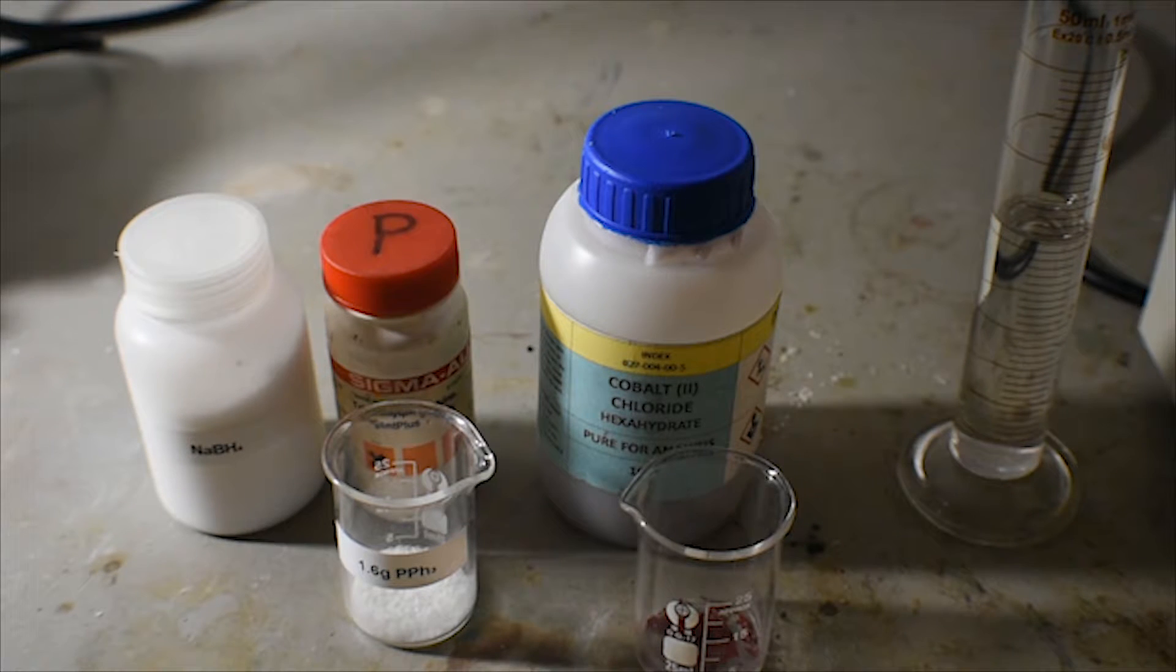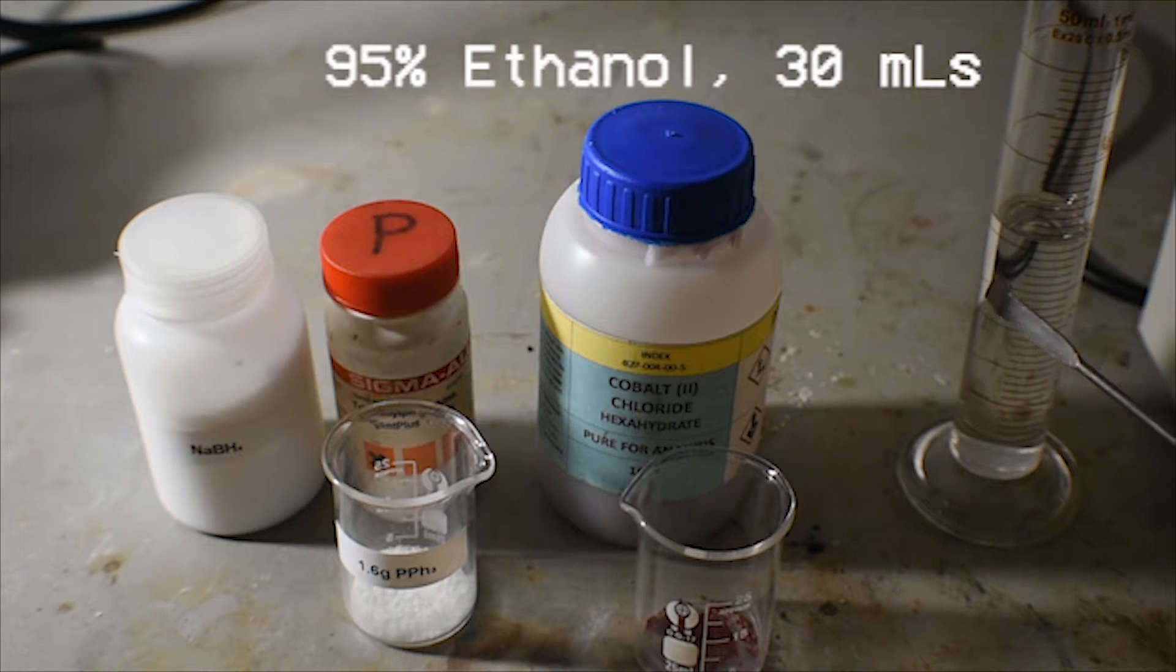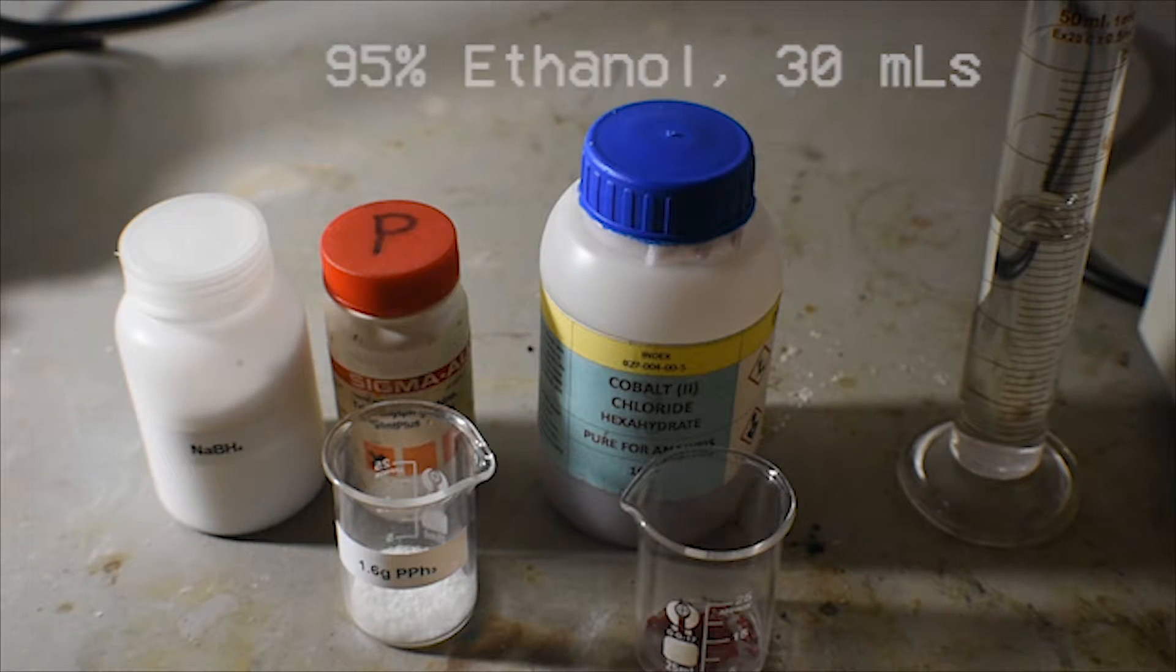As the solvent for the reaction, I'm going to use 30 milliliters of denatured ethanol. This is about 95% ethanol or greater. We want to exclude water for this synthesis, as it can mess things up a little bit. So let's get to the first step, which entails dissolving both the triphenylphosphine and cobalt-2 chloride hexahydrate in hot ethanol.